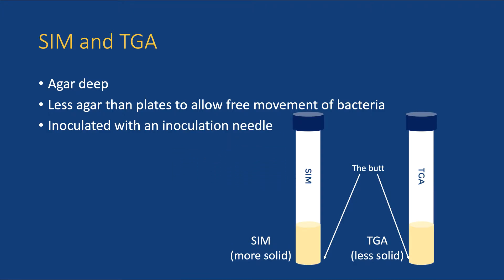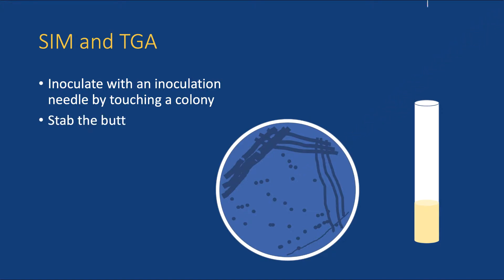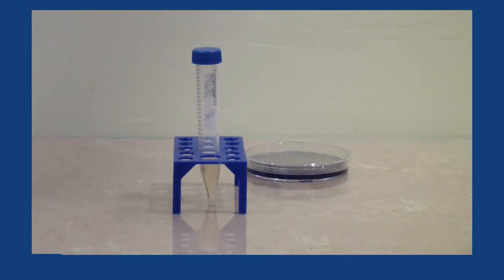With an inoculation needle, touch a colony on an MSAT plate. Remove the cap of the tube with the pinky of your dominant hand and keep the cap there. Do not place the cap on your workbench to avoid contamination. Working quickly, stick the inoculation needle down the center of the tube all the way to the bottom. This is called stabbing the butt. Pull the needle straight out when you're done.